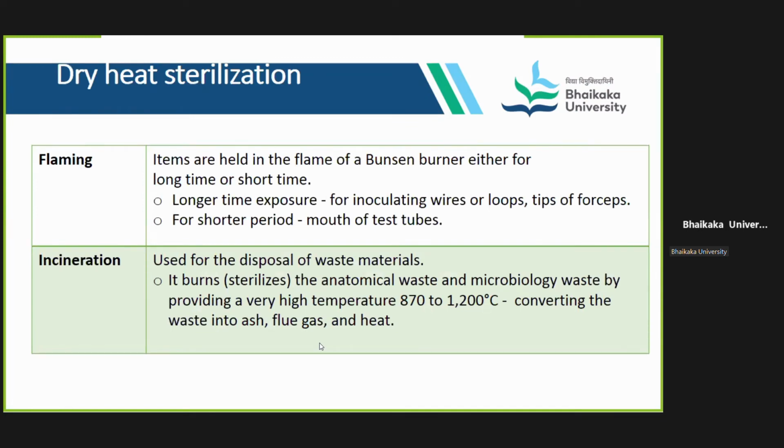Dry heat sterilization techniques, you use flaming and incineration. When you come to laboratory or when you work in a microbiology laboratory, you will see those straight wires and loops that we saw. Or we work with the liquid media, we work with culture plates. So flaming is not going to be used in patient care directly. It is used in laboratories to make those wires and loops red hot by putting them in the Bunsen burner flame. So you burn them till they become red and then cool them. So that is considered to be a quite effective method of sterilization.